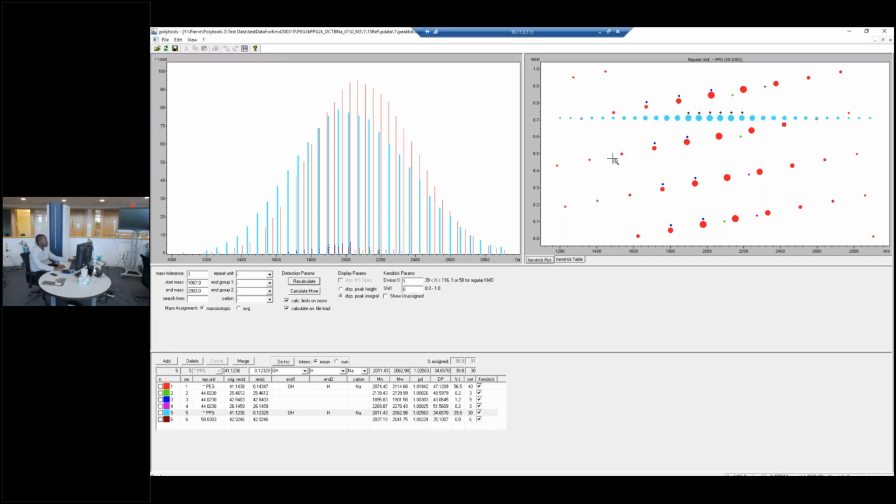And as you guys saw, they all talk with each other. They're integrated together, so you don't have to load the data from your local folder and open up a different software to be able to look at it. It basically loads up into the different softwares as you're analyzing and as you go, and you can come back and change it if needed.